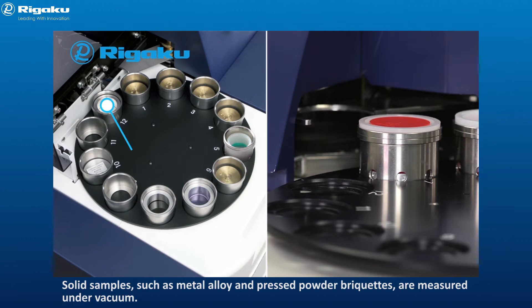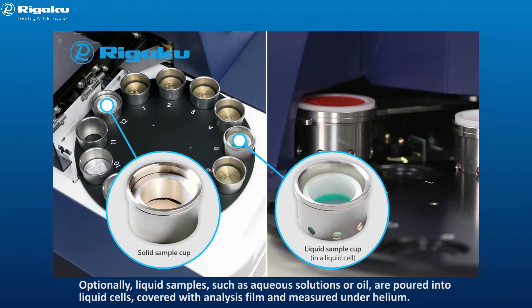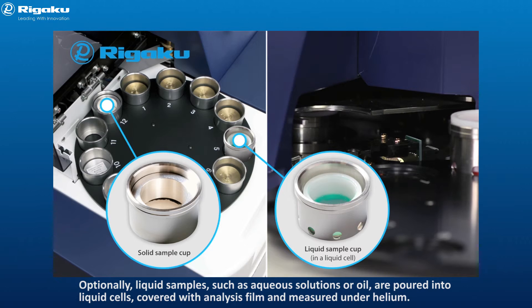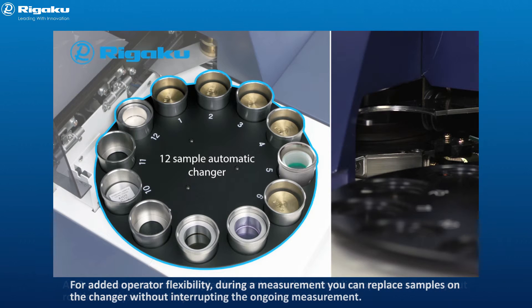Solid samples such as metal alloy and pressed powder briquettes are measured under vacuum. Optionally, liquid samples such as aqueous solutions or oil are poured into liquid cells, covered with analysis film, and measured under helium. A 12-position automatic sample changer is standard, enabling operators to carry out routine analysis smoothly. During a measurement, you can replace samples on the changer without interrupting the ongoing measurement.